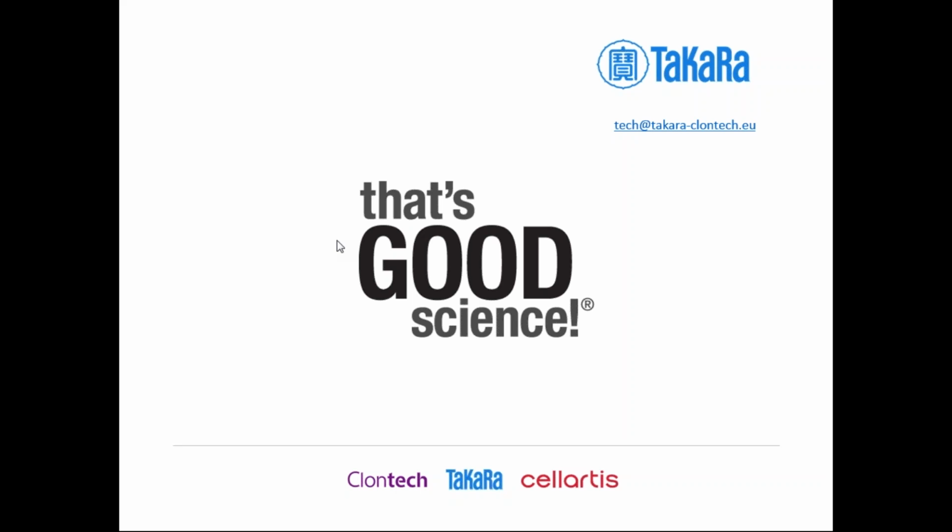The cells which are the most tricky to deliver with VSV-G pseudotype lentivirus or Gesicles are more hematopoietic stem cells, B cells, or non-stimulated B cells and T cells. So for neurons, I would say it would be worth giving it a try. Another question again is whether it has been tested in primary keratinocytes, and it's a bit the same answer. We have not tested it in-house, but I think it should work.